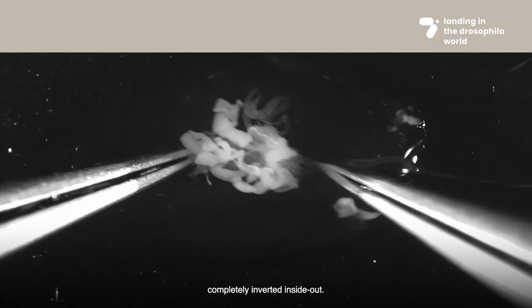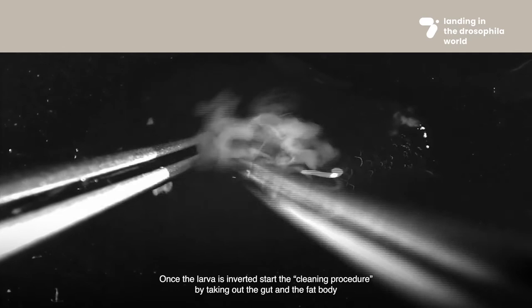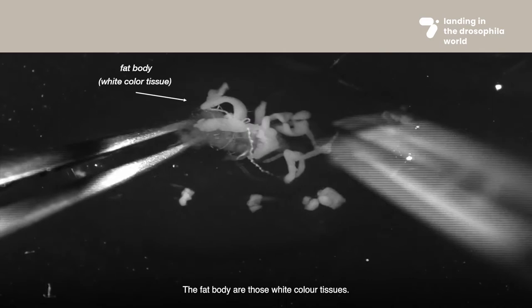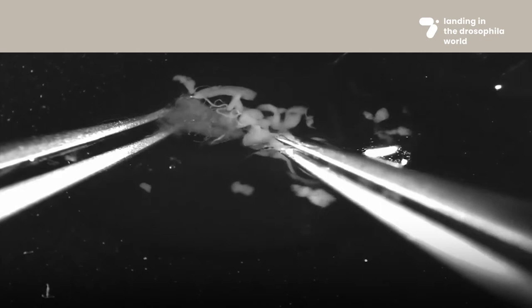Gently continue pushing and rolling the body wall along the tweezer until the larva is completely inverted inside out. Once the larva is inverted, start the cleaning procedure by taking out the gut and the fat body to expose the tissues of interest. The fat body are those white colored tissues.